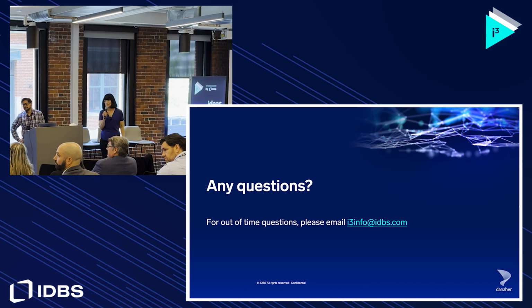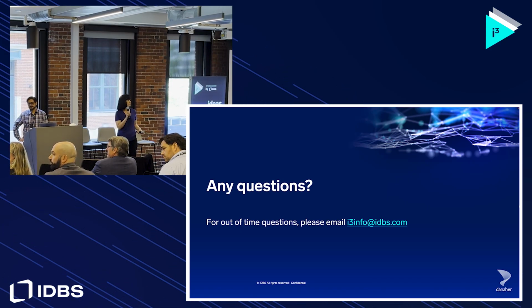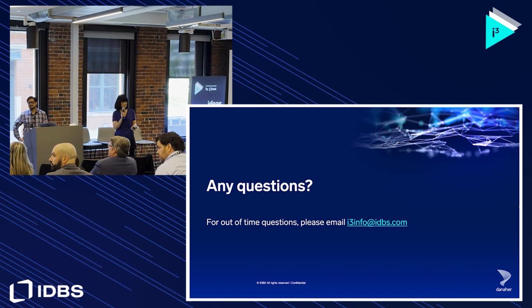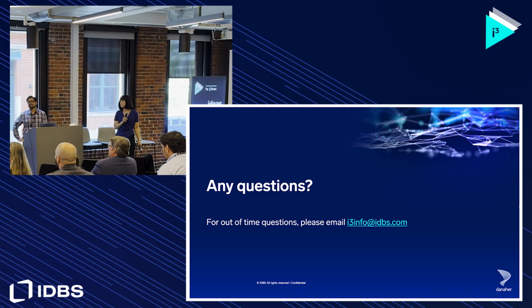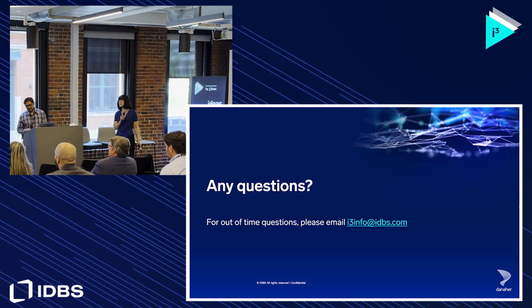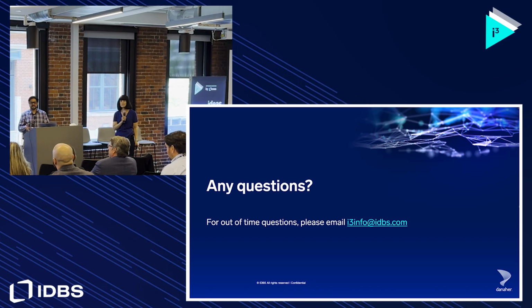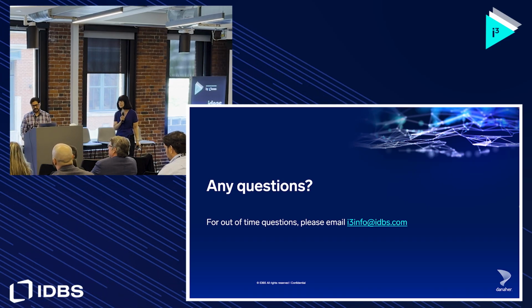Yeah, thank you. Great presentation. Thanks. So for the results that you're generating on these samples, are you really storing them just within E-Workbook, or are you tying them back to the item in inventory and your results kind of living in there? Raw data is stored in E-Workbook because that's our data repository essentially, but we use a LIMS system outside, and we're working on getting that better.